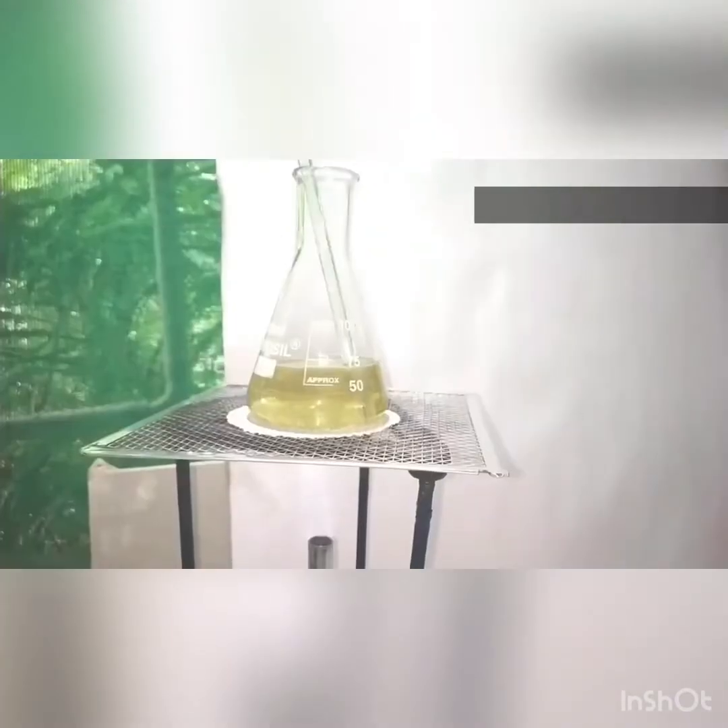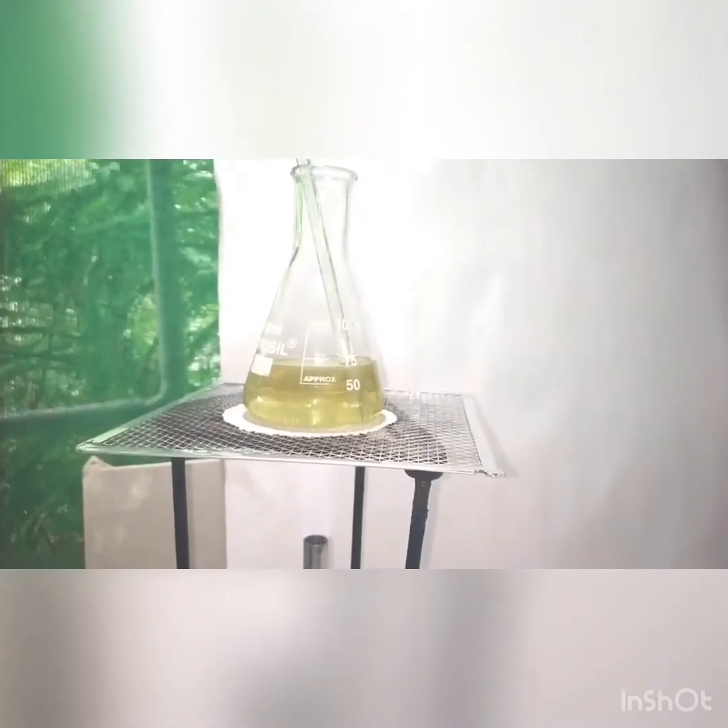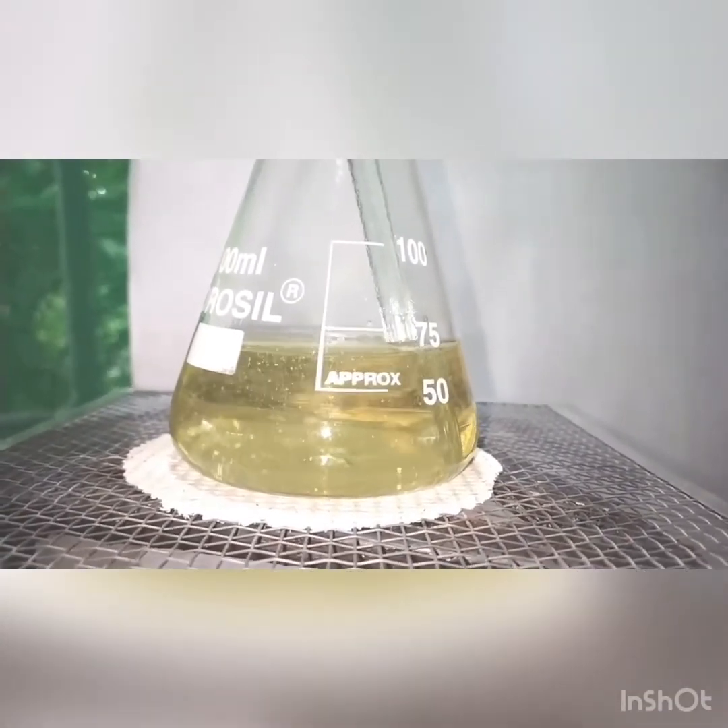Now we heat the solution until the turbidity disappears and the solution becomes clear. When the solution is clear, we set it out from the heat source for cooling.